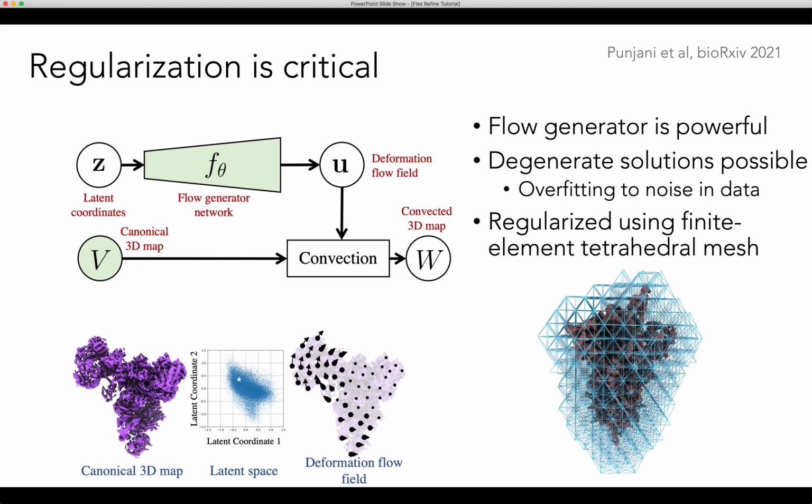Since the interfaces between different domains in the spike protein are quite small, it's very likely that across every boundary between 2 domains that might need to move apart or shear relative to each other, there's a tetracell that spans that interface. So a single tetracell within our mesh will contain density on both sides of the interface between 2 domains.